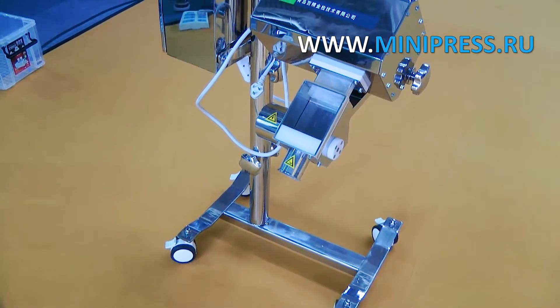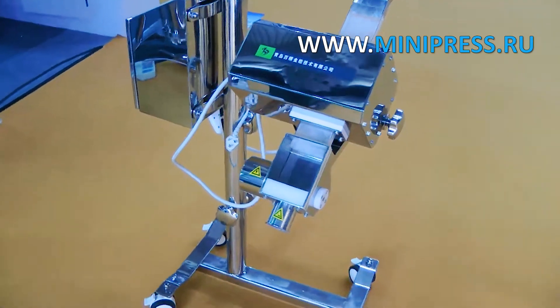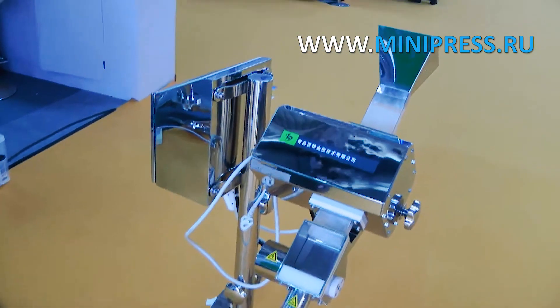Metal separator for inspection of tablets and capsules. German technology. The main control board is exported from Germany, ensuring high scanning sensitivity and high reliability.